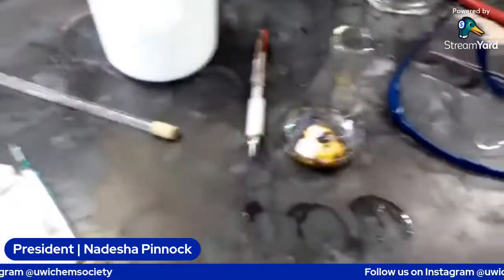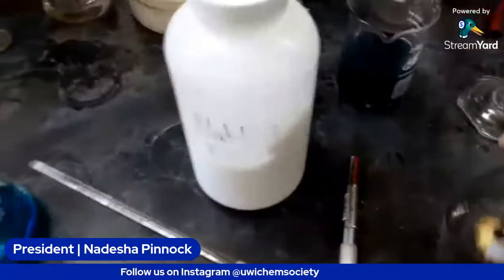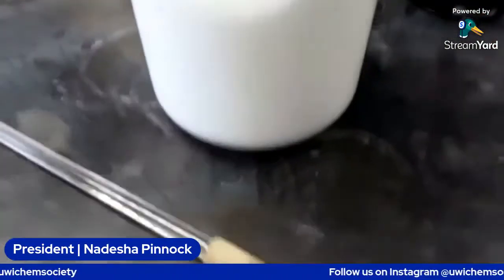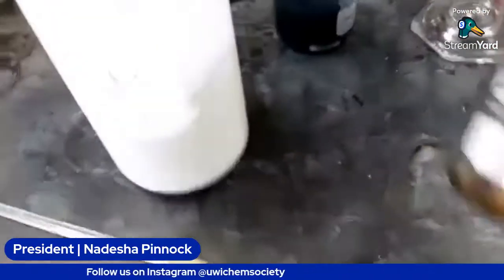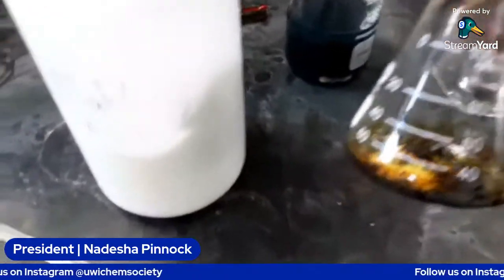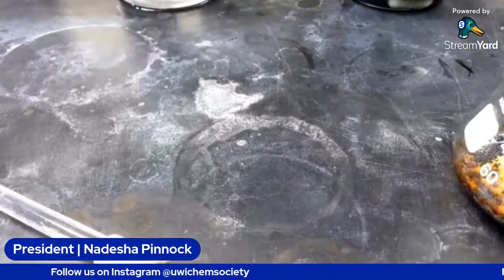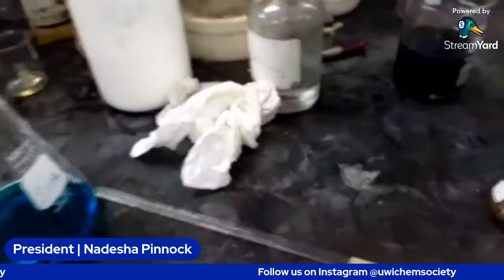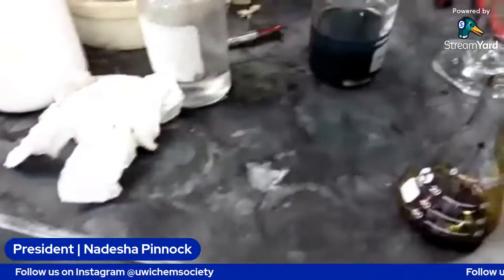So we're just going to add distilled water to this conical flask and dissolve all of this. We could move it to a bigger conical flask or beaker so that we can hold 50. Well, this should be able to hold it, because this is a 100 ml conical flask. So let me get some distilled water to add to it. This is our distilled water. We're going to add approximately 50 ml.